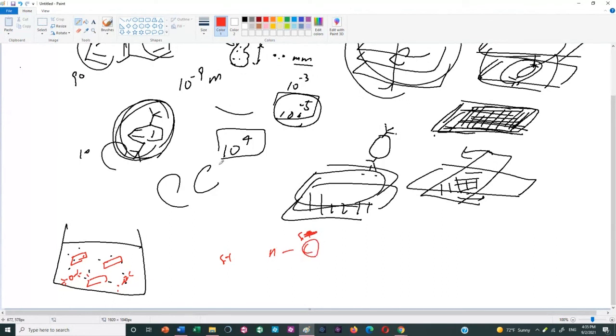All of these compounds have a little bit of positive, a little bit of negative, on different parts of the compound. Naturally, they're attracting. But because of the motion energy we give at the boiling, they just break the intermolecular force and go away from each other, and they got dissolved.